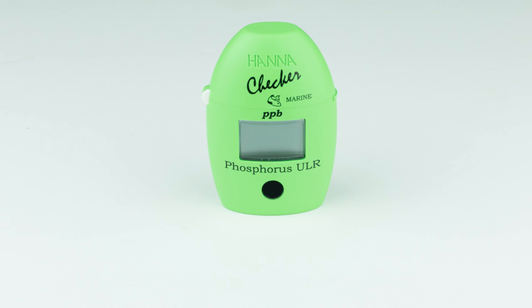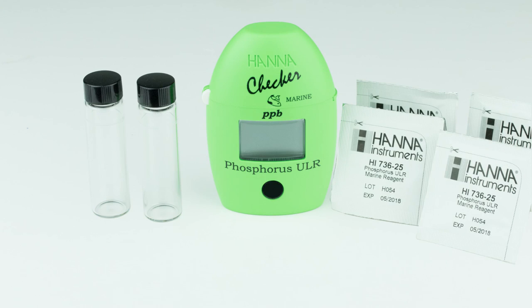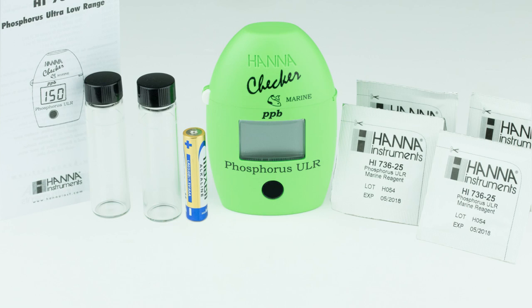The HI736 kit comes with everything you need to begin testing: two sample cuvettes with caps, a phosphorus ultra low-range reagent starter kit, a AAA battery, and the instruction manual with quick start guide.